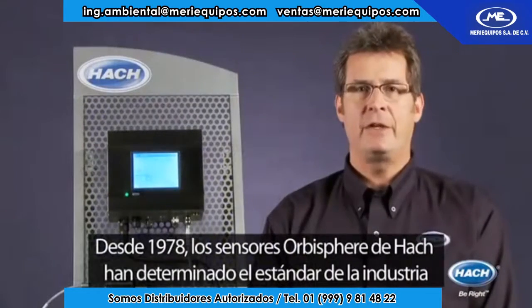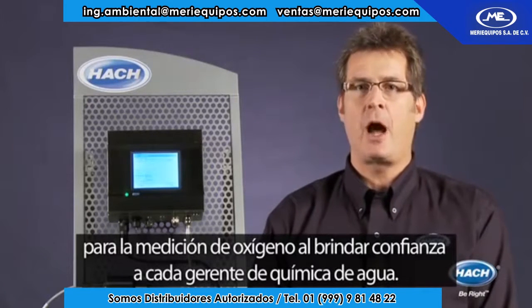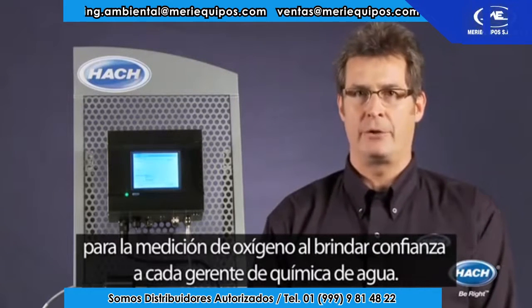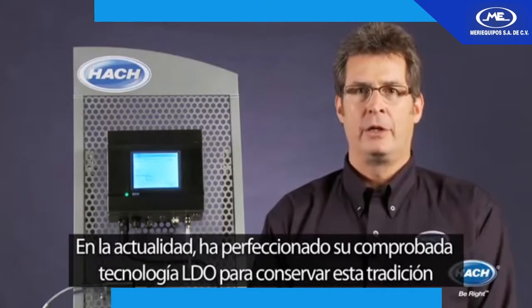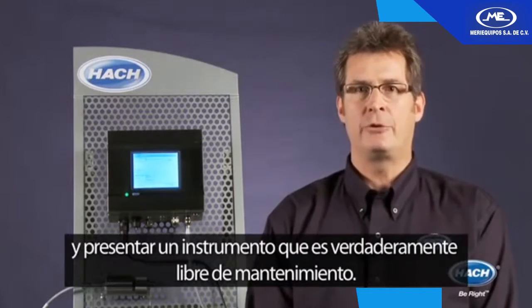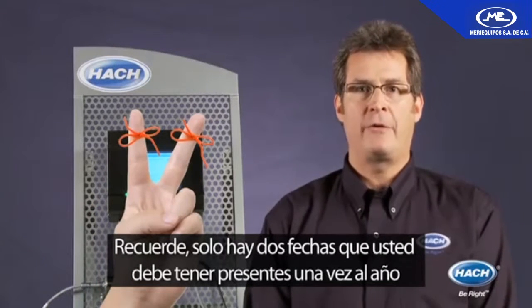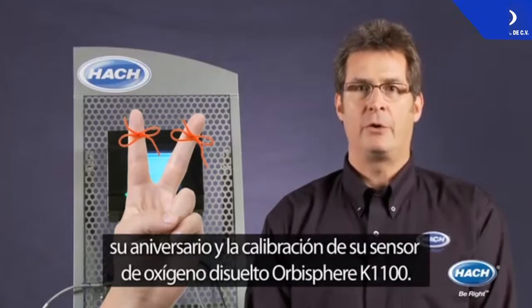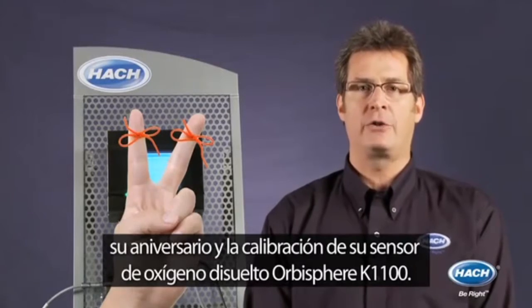Since 1978, Hock Orbisphere sensors have set the industry standard for oxygen measurement by delivering confidence to every water chemistry manager. Today, we have perfected our proven LDO technology to maintain this tradition and deliver an instrument that is truly maintenance free. Remember, there are only two dates you have to remember once a year: your anniversary and the calibration of your Orbisphere K1100 Dissolved Oxygen Sensor.